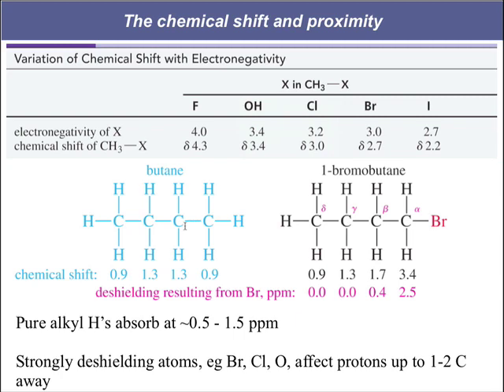These hydrogens on secondary carbons are surrounded by more carbons than the primary hydrogens are. So these guys in the middle are actually being deshielded because they're closer to more carbons. That effect is really small.